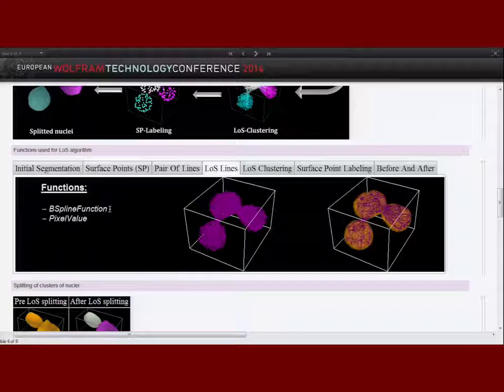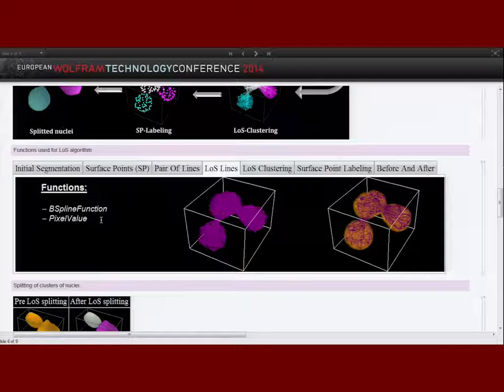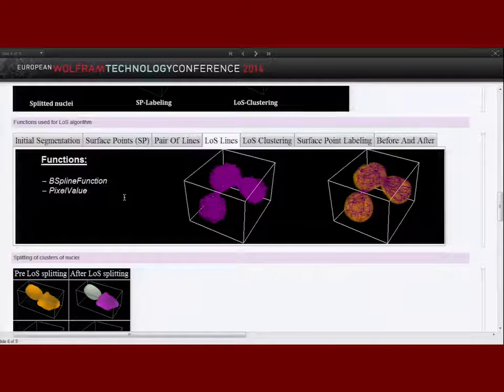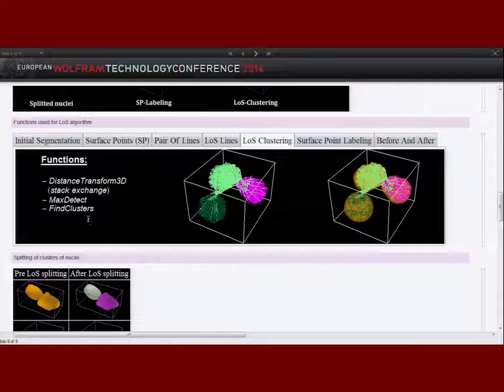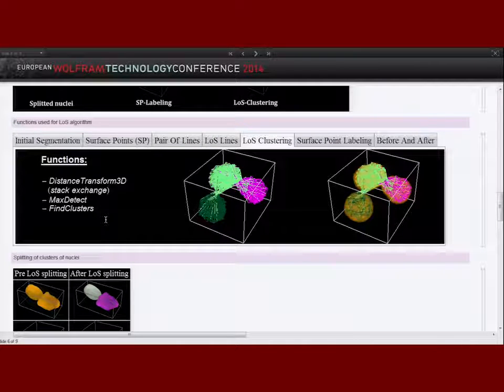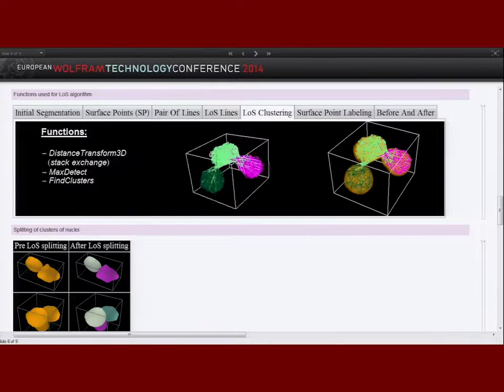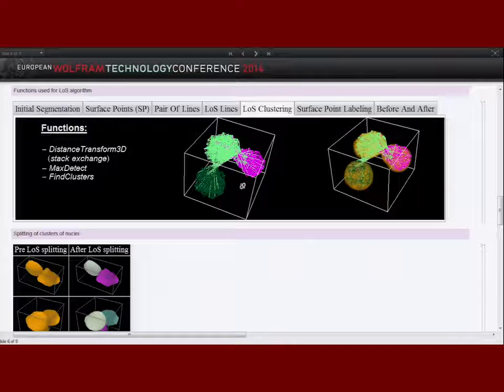To distinguish lines of sight, I use the BSplineFunction to calculate an interpolation line between each pair of surface points. With PixelValue, I then check for each point of that interpolated line what the pixel value is. If that value is a background value, then the line is leaving the inner volume; if the pixel value is that of the object foreground, then it's still inside the object. I can then distinguish between lines of sight and non-lines of sight. I then use FindClusters to cluster these lines. The clustering treats pairs of lines of sight as less similar if their chessboard distance is too large — meaning if two lines are too far apart they are not in one cluster. Different colors indicate different clusters.